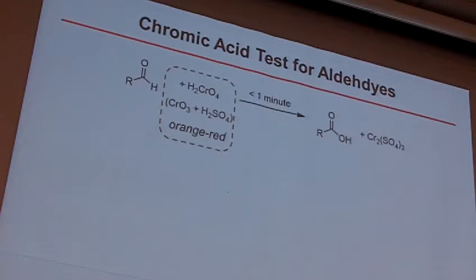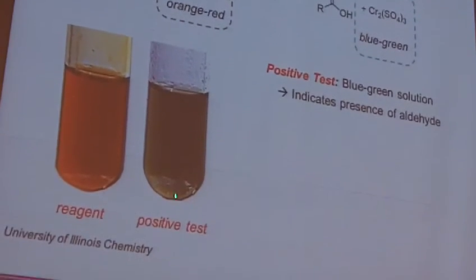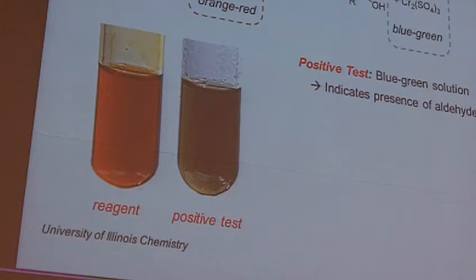What happens is this chromic acid reagent is orange-red. And then when you react it, you're going to get a blue-green. This chromium compound that comes out the other side is a blue-green mixture. So it's going to definitely change color. And here's an example. You have to kind of squint and look to see if it's blue-green. Maybe that shows you a little bit of blue-green up there. But you see a pretty distinct color change. You go from this orange-red compound to something that's a blue-green solution.